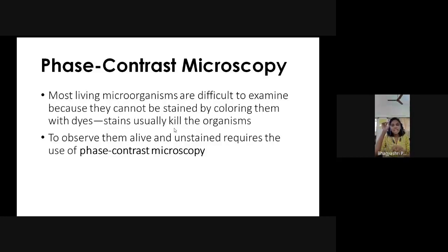When you observe the same organism by gram staining on one slide and by negative staining on another slide, the negative staining slide will show you larger cells as compared to gram staining, because in gram staining you perform heat fixing. Because of that, the cell undergoes shrinkage, and in negative staining, you want to observe the original morphology of the bacterial cells.